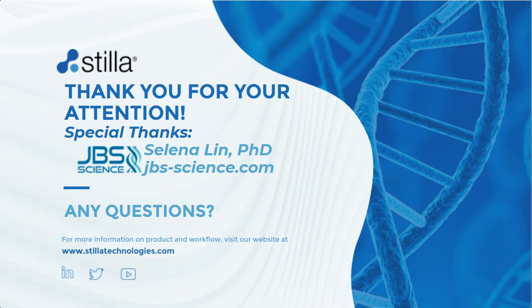Okay, thank you. Dr. Gutierrez, for the 6-color Prism, are you limited to the 6 fluorophores shown in the presentation? No, absolutely not. As you can see, we give the wavelength, the excitation, and the emission spectrum for each channel. So as long as your fluorophore fits within that spectrum, then you should be able to know which channel that fluorophore will emit in.